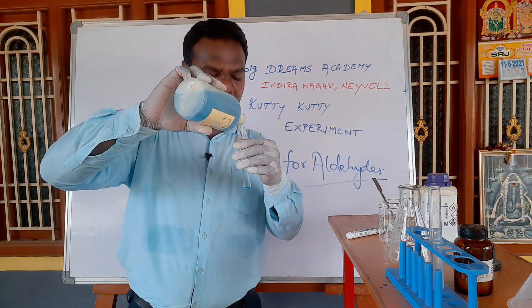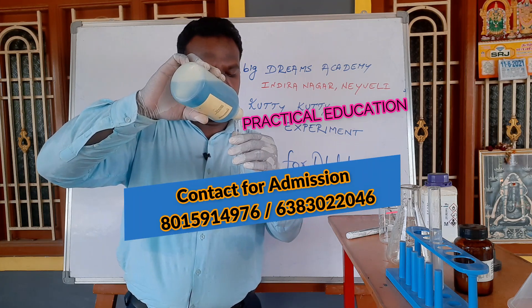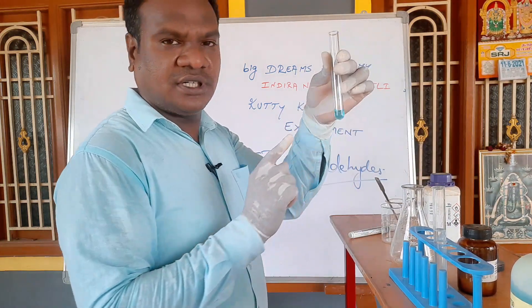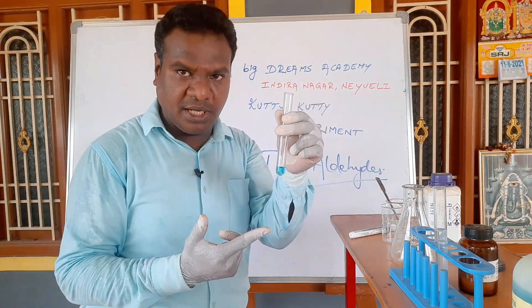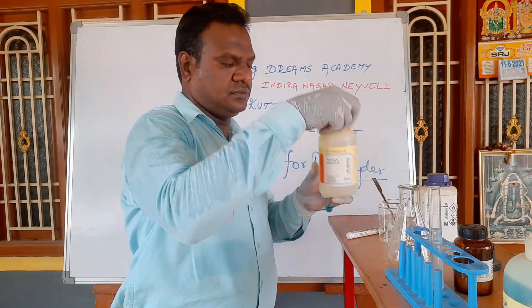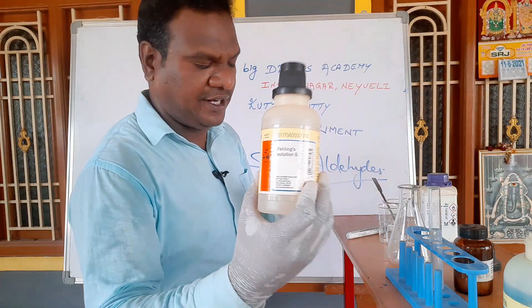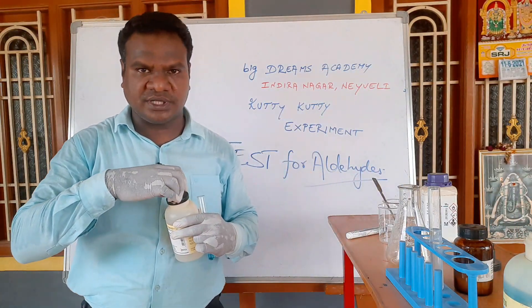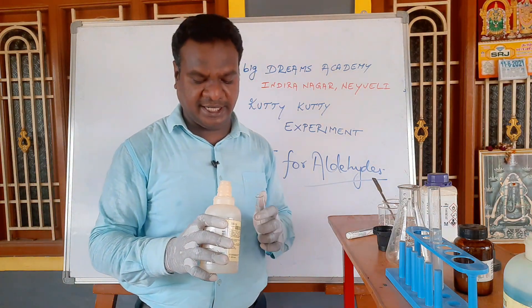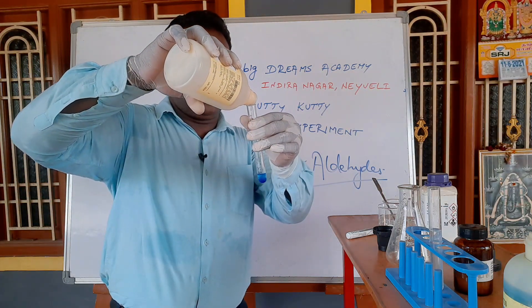So we take 1 ml of Fehling solution A and 1 ml of Fehling solution B. Fehling solution A is copper sulfate and Fehling solution B is sodium potassium tartrate.